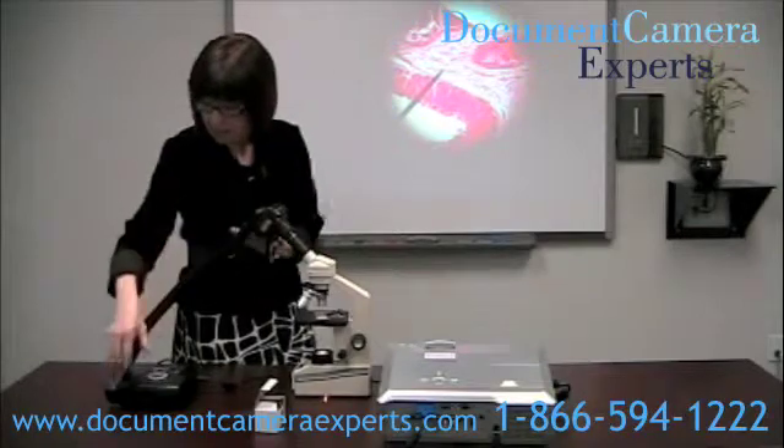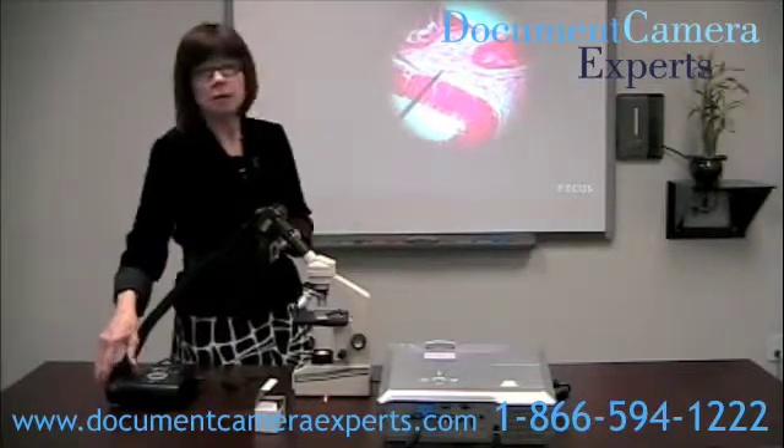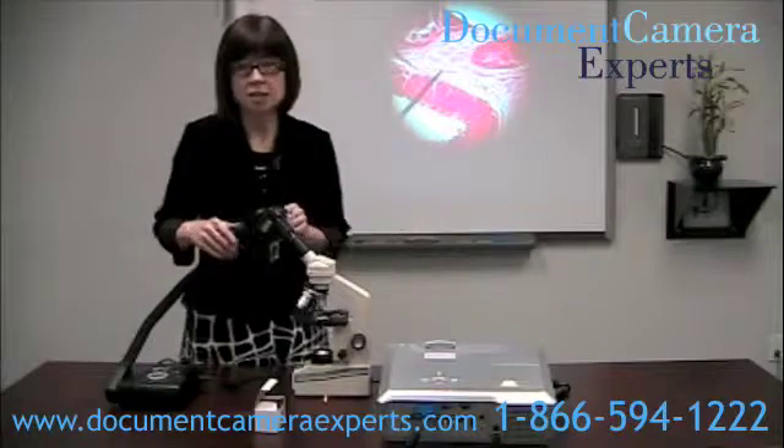I'm just going to secure that, and now we'll press the autofocus to get an even clearer image, and there's our lovely image of our cell.